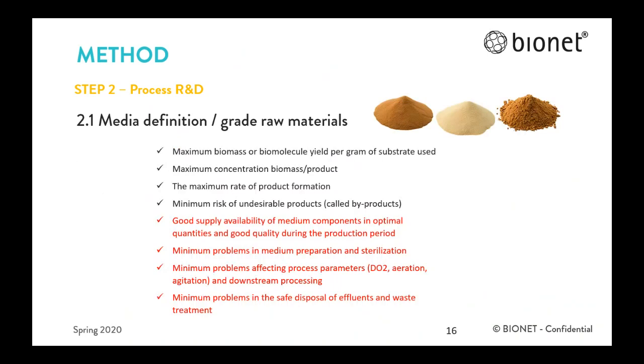Consider the right selection of the media for the scale-up, because at a small scale, it usually is easy and relatively cheap to use some media. But we must have in mind the scale-up.